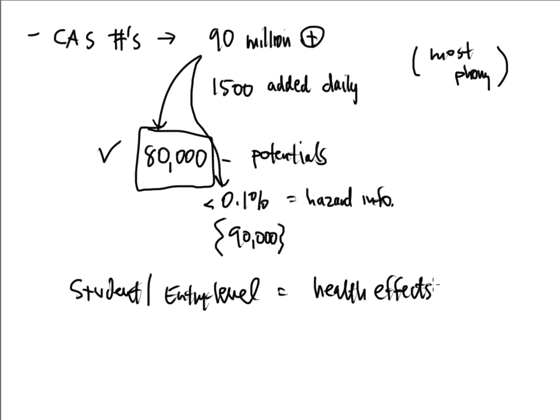Sometimes in their head, they think that some of the simple knowledge is something you should know. And that's not necessarily the case, because they could have been in it for 20 or 30 years. And maybe they know all of the dangers of something like an alcohol or an ether, and they just take it for granted that you know it as well. So where can we find this information?